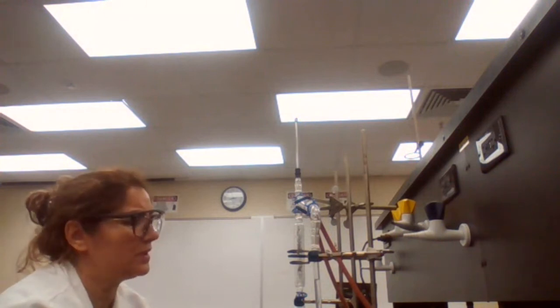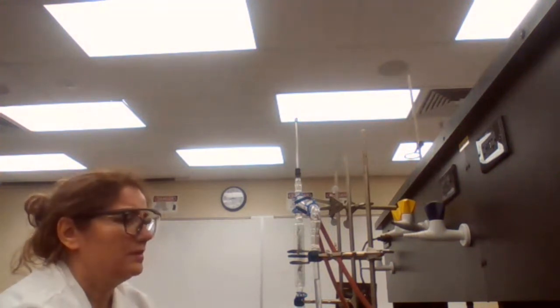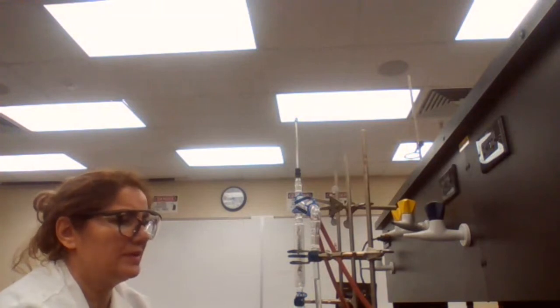Have you looked up the boiling points for toluene and cyclohexane? Do you know which one has the higher boiling point, which one is the lower boiling point? So you actually are working for your low boiling point first: is it toluene or cyclohexane?